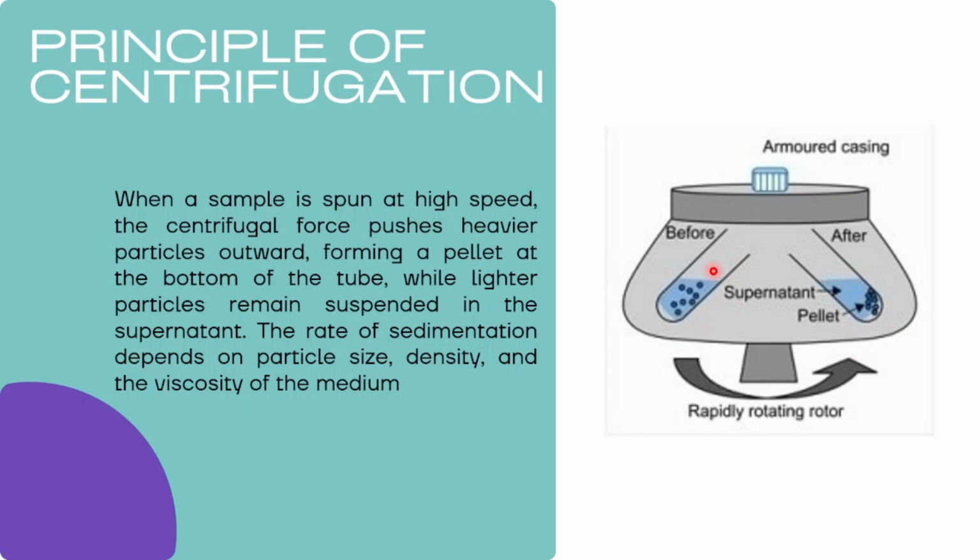Now, the rate of this sedimentation is dependent on the size and the density of the particles as well as the viscosity of the medium. So, sucrose, for instance, is more viscous than water. So, the rate at which a particle would travel through sucrose to the bottom of a tube would definitely be different from how fast it will travel through water.